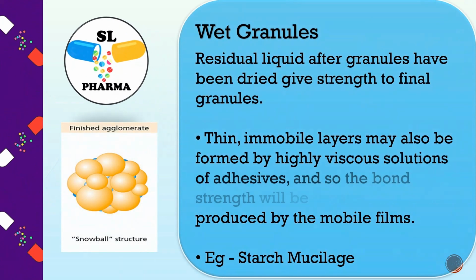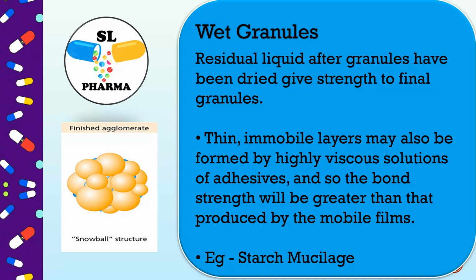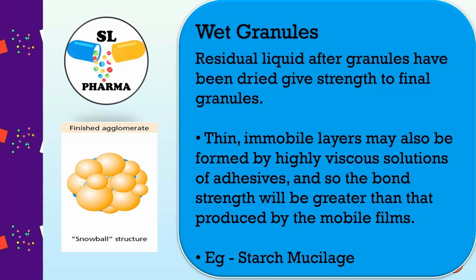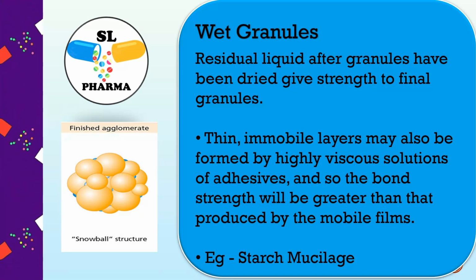Wet granules. Residual liquid after granules have been dried gives strength to final granules. Thin immobile layers may also be formed by highly viscous solutions of adhesives, and so the bond strength will be greater than that produced by the mobile films. For example, starch mucilage.